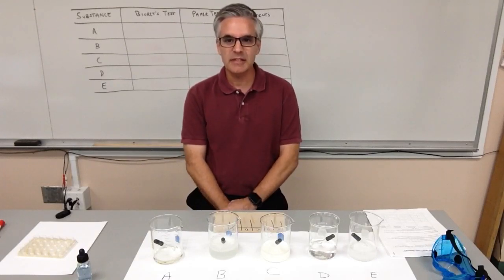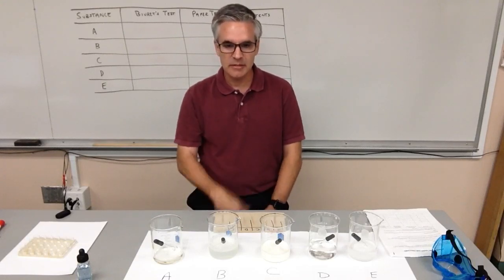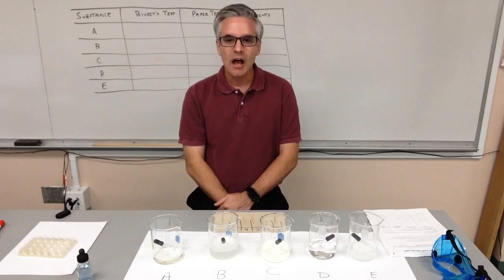So your hypothesis is to guess which one you think of those 4 choices is in each of these substances. So you basically have 5 hypotheses, really. And for safety, we do have chemicals that we're using.